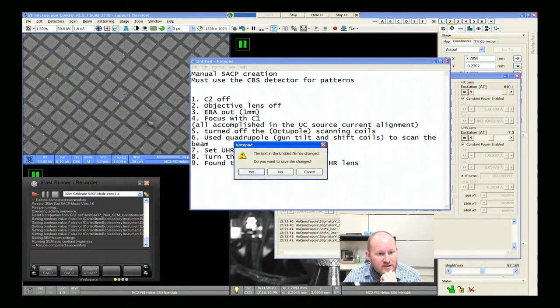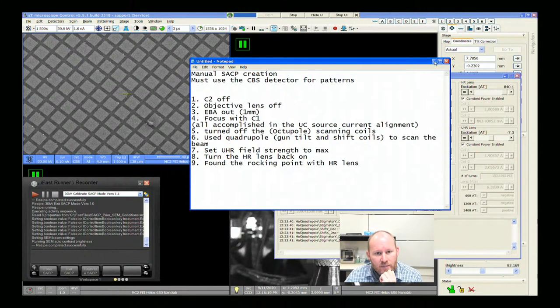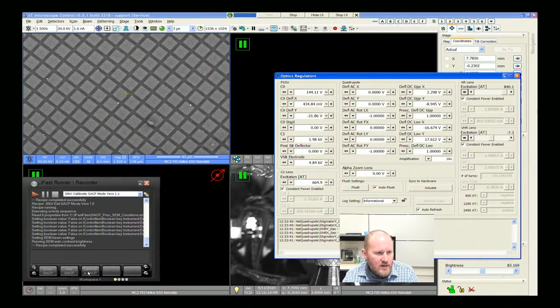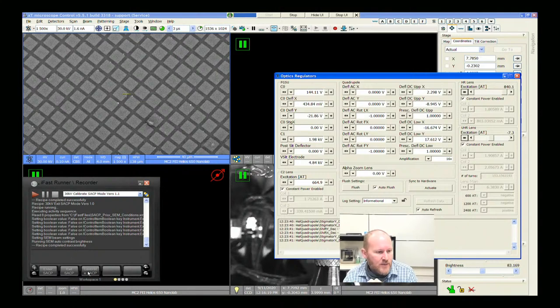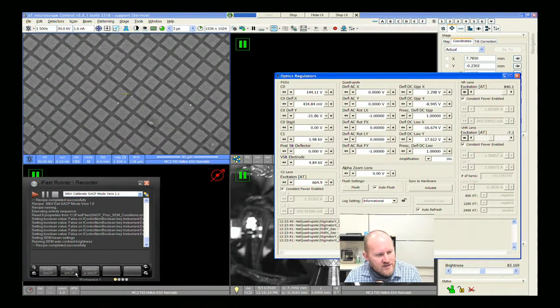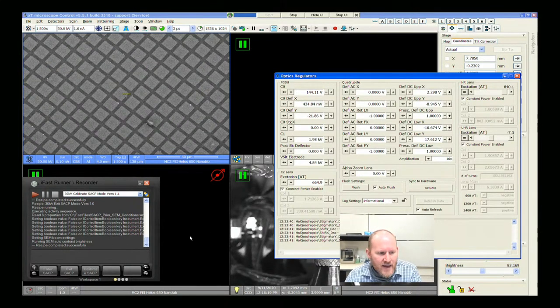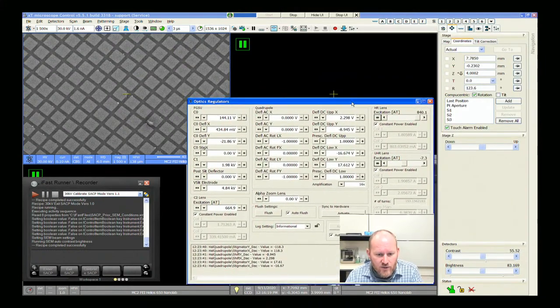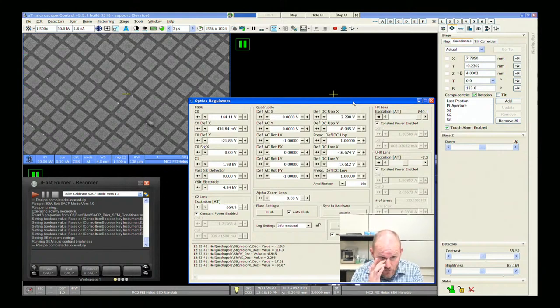We turned the UHR field strength to max simply because we need a compound lens effect to get the full rocking — basically to get the pivot point coincident with the sample surface we need a very strong field strength. We then set the HR lens back on and use that to build this compound lens and get the rocking point directly coincident with the sample surface. That's the gist of SACP creation on the Helios.